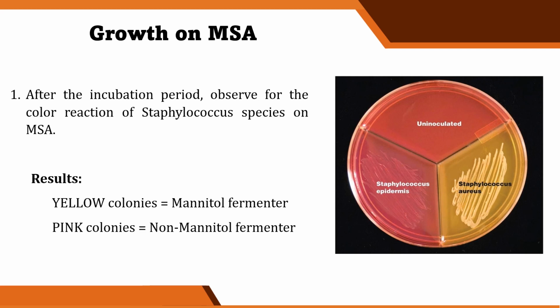Okay. So yung color indicator na kasama ng MSA is phenol red. Take note of that po. Okay? Yun. So, sino ba yung mannitol fermenter sa kanila? So, mannitol fermenter natin is si S. aureus. Okay? So, you can see na nagbago yung naging kulay ng agar. Okay?